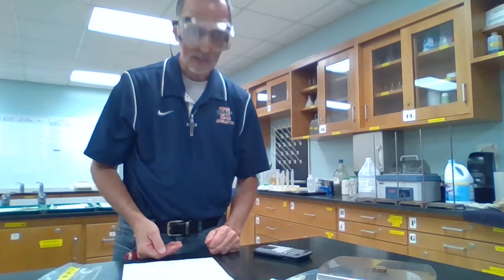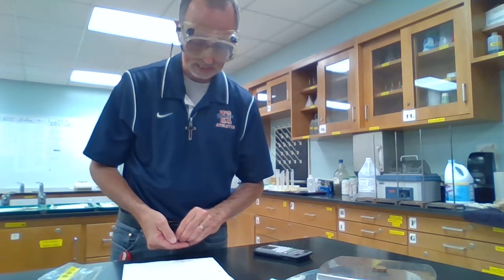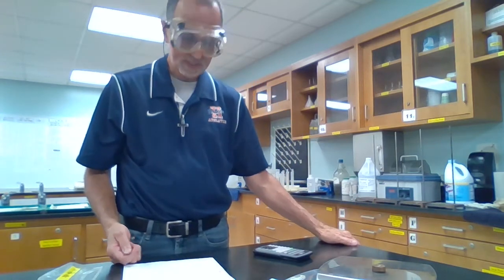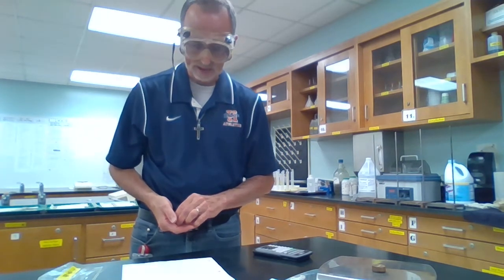3 pennies, 9.26 grams. 9.26. Then I need to add 2 more. We need 5 now. 5 pennies, 15.37 grams. 15.37.